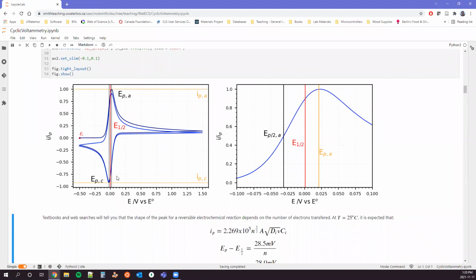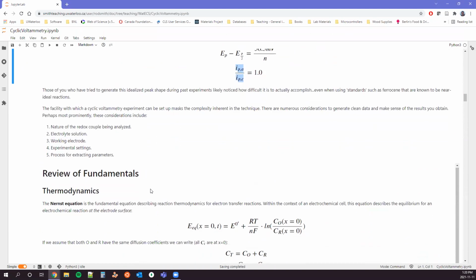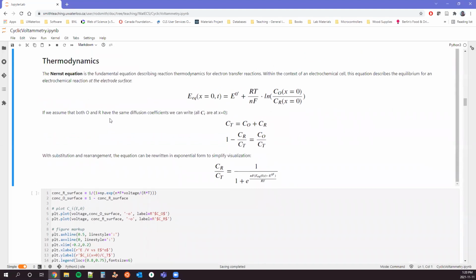How you process it, of course, is going to have an impact on the specific number that comes out of the back. So to get started, we'll do a quick review on some of the fundamentals, just so that we understand properly exactly what's happening in an electrochemical cell in these ideal situations, so that when we move away from ideality, we can understand what happens and what effect we're going to have.